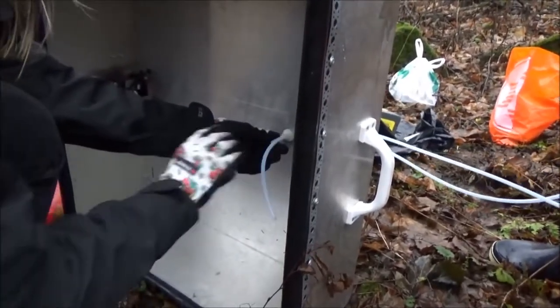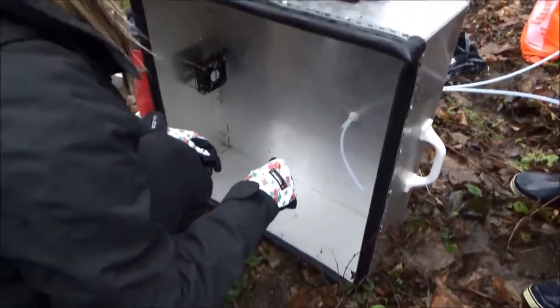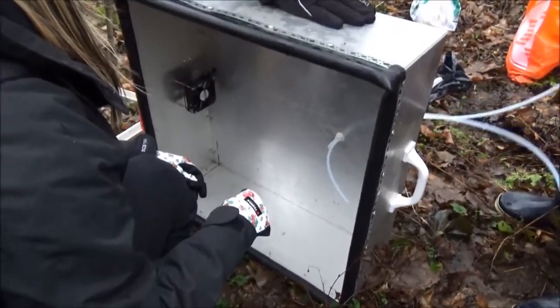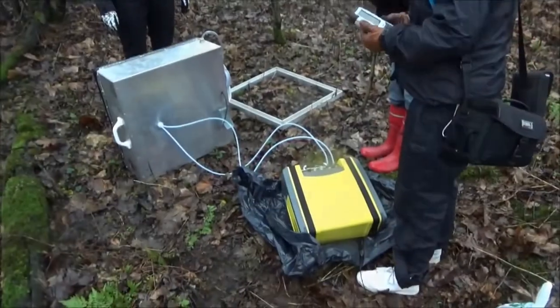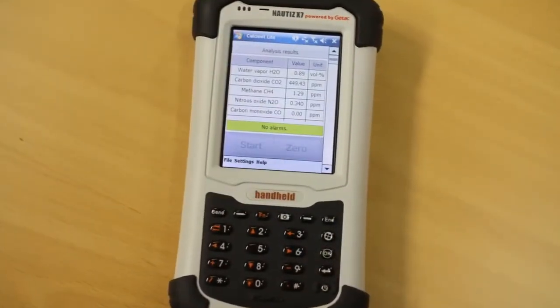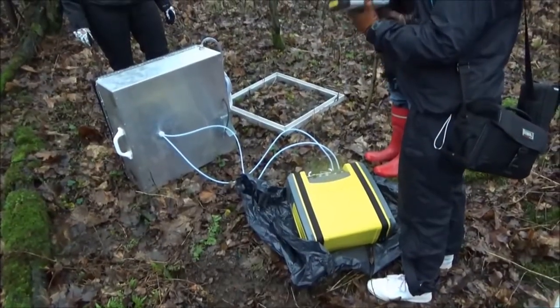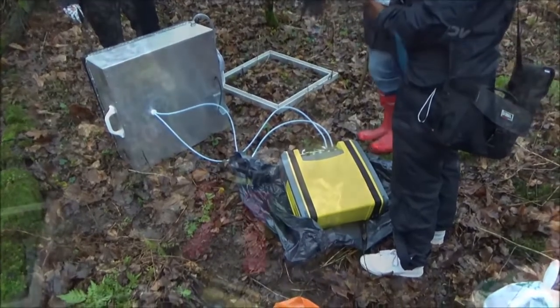The emission gas samples were collected from the chamber's headspace, whereas the outlet tube was placed near the soil surface. The analyzer was operated by a PDA — personal digital assistant. Communication between the analyzer and the PDA is wireless with Bluetooth protocol.